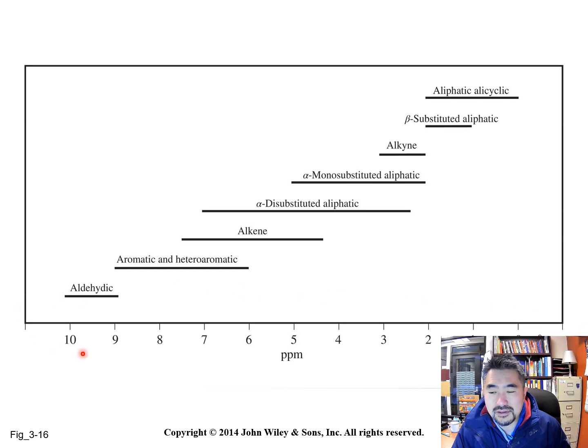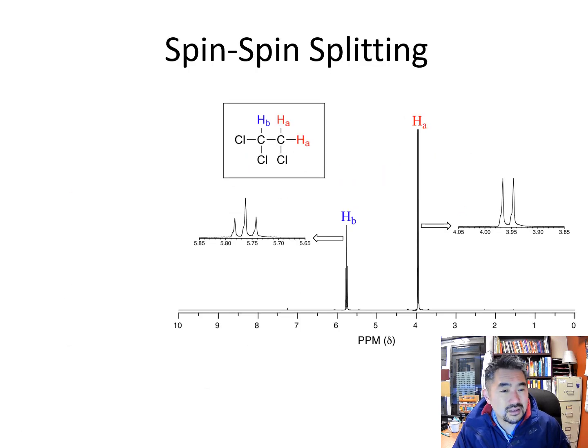Now, remember seeing chemical shift tables like this. This one particular one is from your textbook that I hope you bought. Depending on the chemical shifts, you could tell what kind of chemical environment they're in. And splitting is often the most important, or maybe the confusing part. Remember, it tells you not how many protons you have on that carbon, but how many neighboring protons you have. So if you look at the signal for this proton right there, it's a triplet. That doesn't mean, remember the n+1 rule, right?